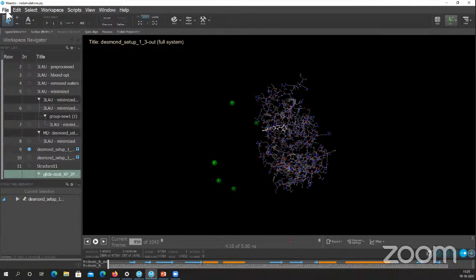I can show the demo of the docking results and how to use that as a starting point for simulations. Yeah, okay, that'll be great. Okay. You can still see my screen, right, Maestro?